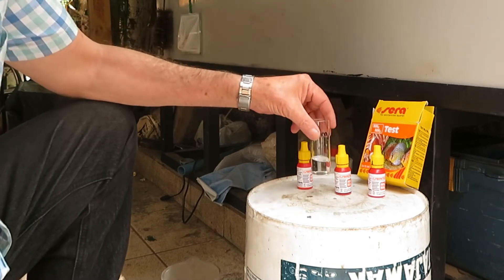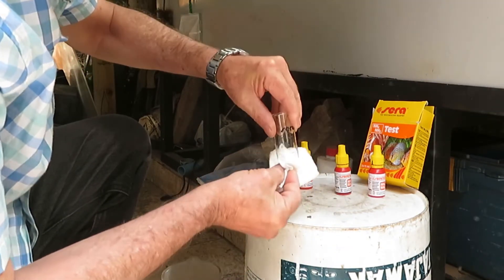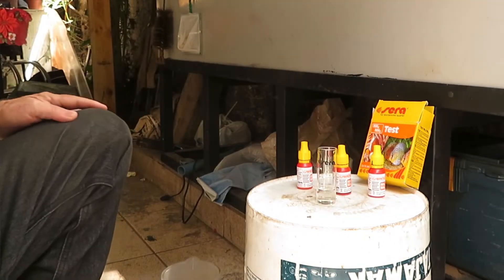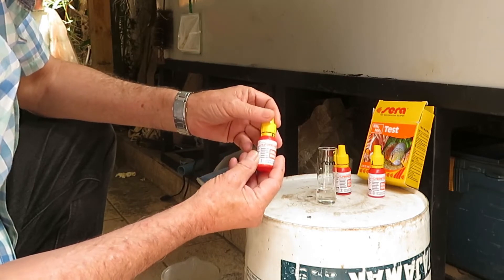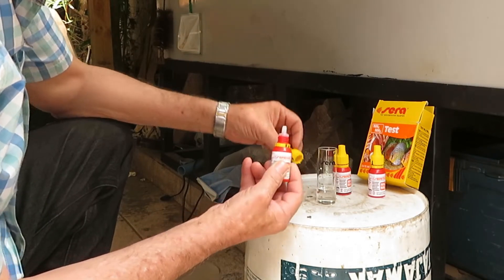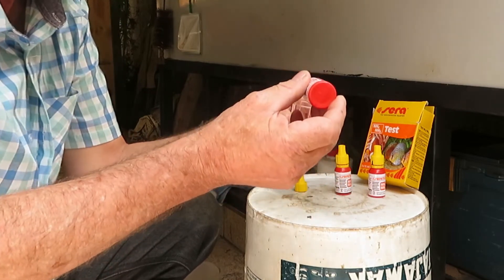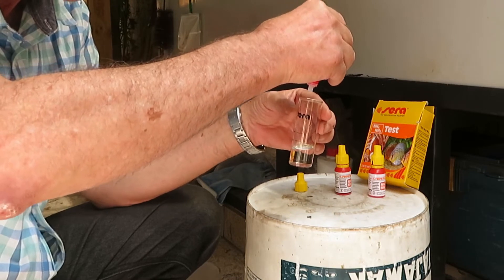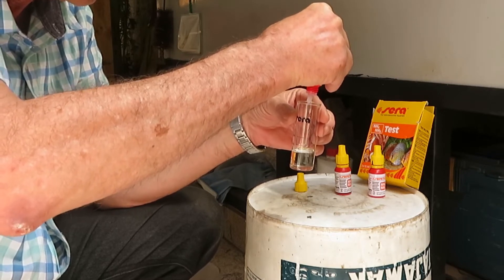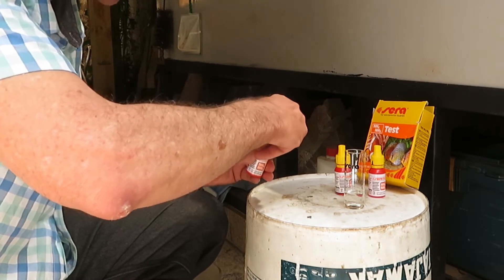Once we have the proper amount of water, we dry the flask on the outside and eliminate any water drops. Then we open bottle 1 and add 6 drops of reagent 1 into the flask. We put the cap back on bottle 1 and shake the liquid carefully so it mixes without splashing.